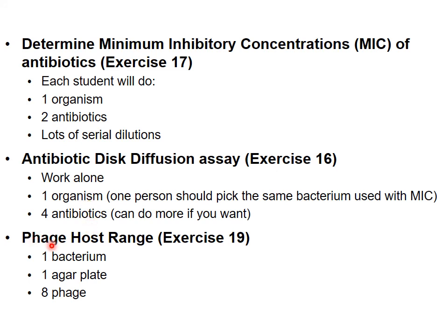And then the last thing we're going to do is the phage host range. We're going to have one bacterium. We're going to put that in top agar, put it on an agar plate, let it sit for a little while to cool down, add our phage, and then we'll incubate it overnight and look at it the next day.